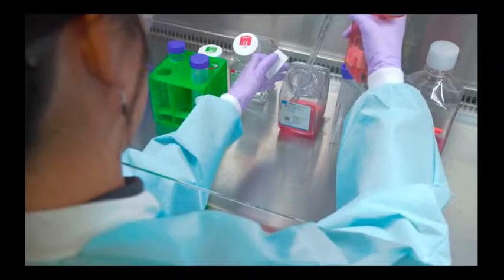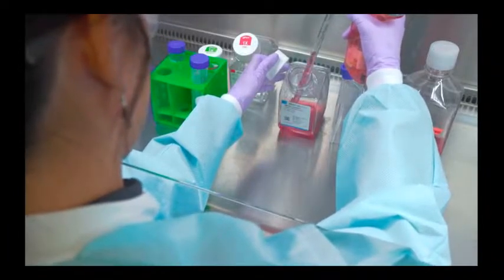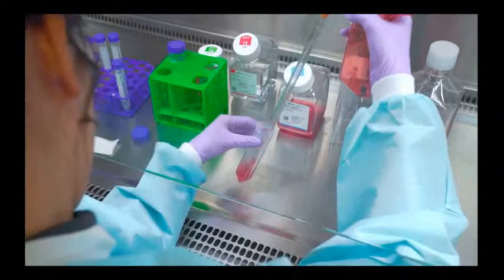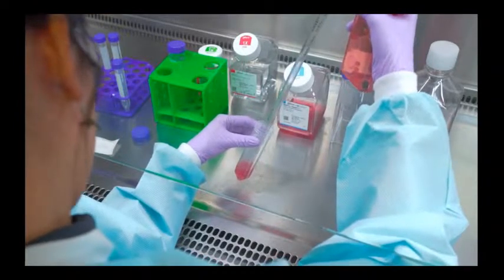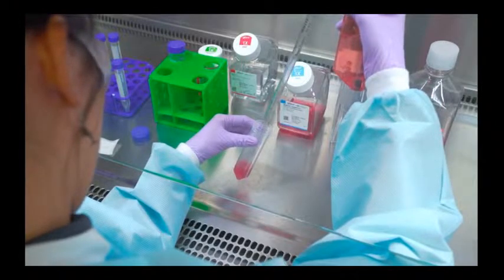Resuspend the pellet with warm, complete growth medium. Gentle pipetting will disperse the cells to ensure a homogeneous solution of single cells. Remove a small sample for cell counting.